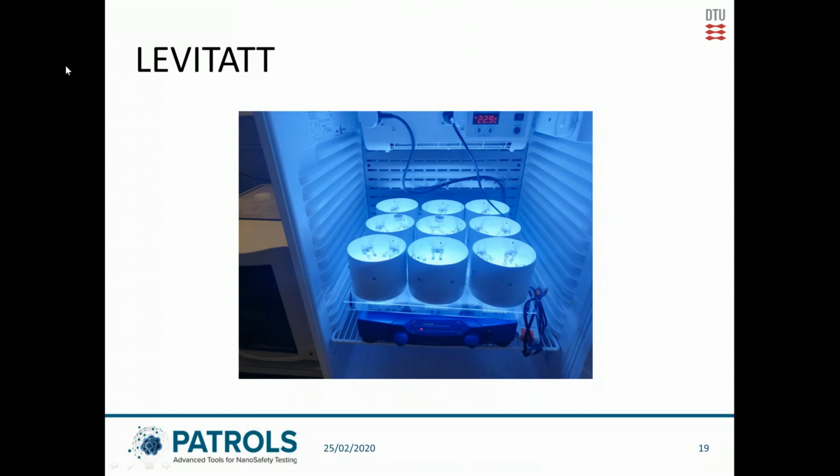Basically, this test setup allows for 45 vials to be used for testing each time with each LEVITATT. To exemplify it, it could be that you're testing one compound at 5 given concentrations, and then with 6 controls, for instance.